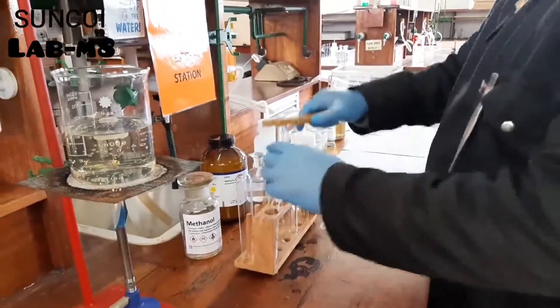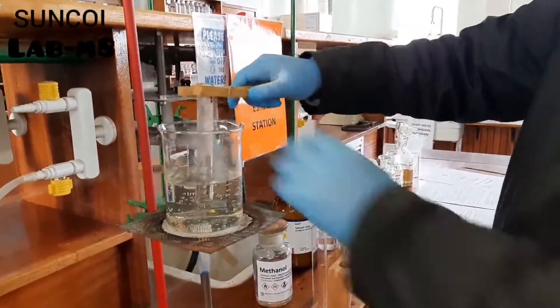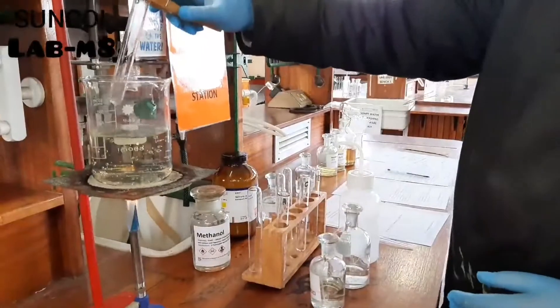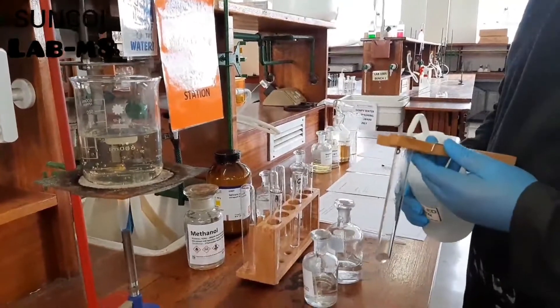Again it goes into the water bath for approximately three minutes. After three minutes we add some distilled water.